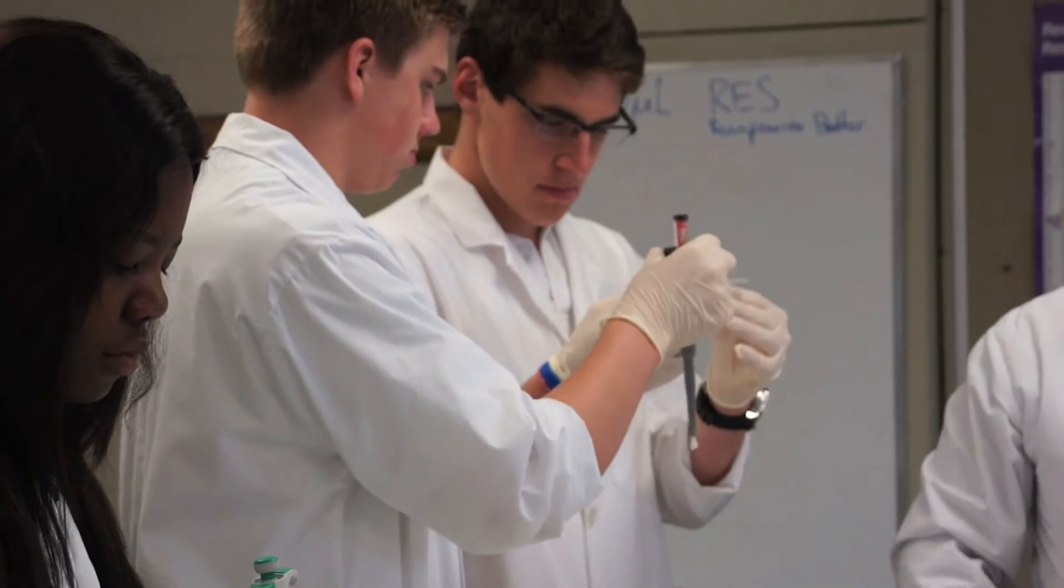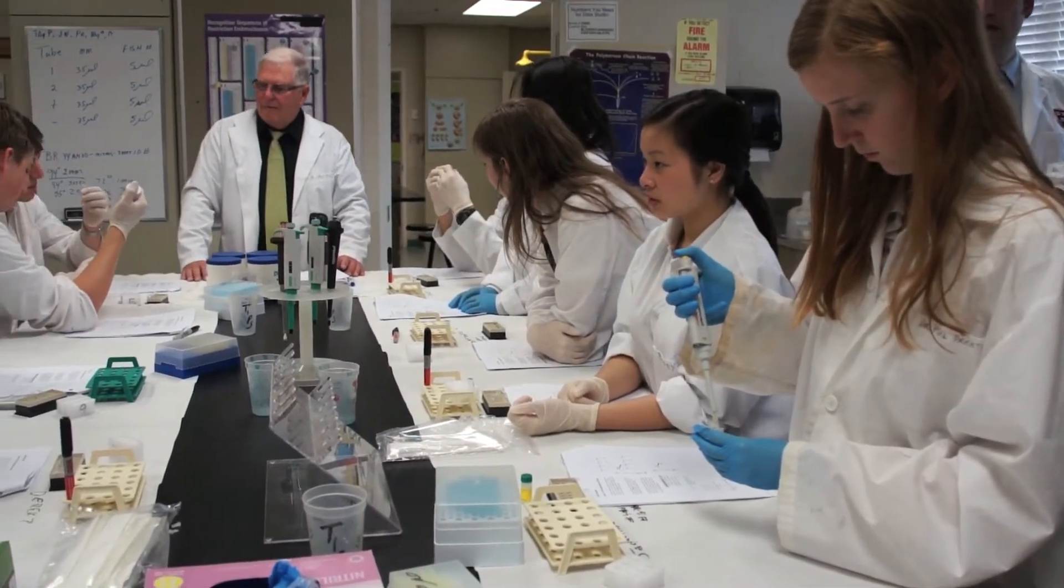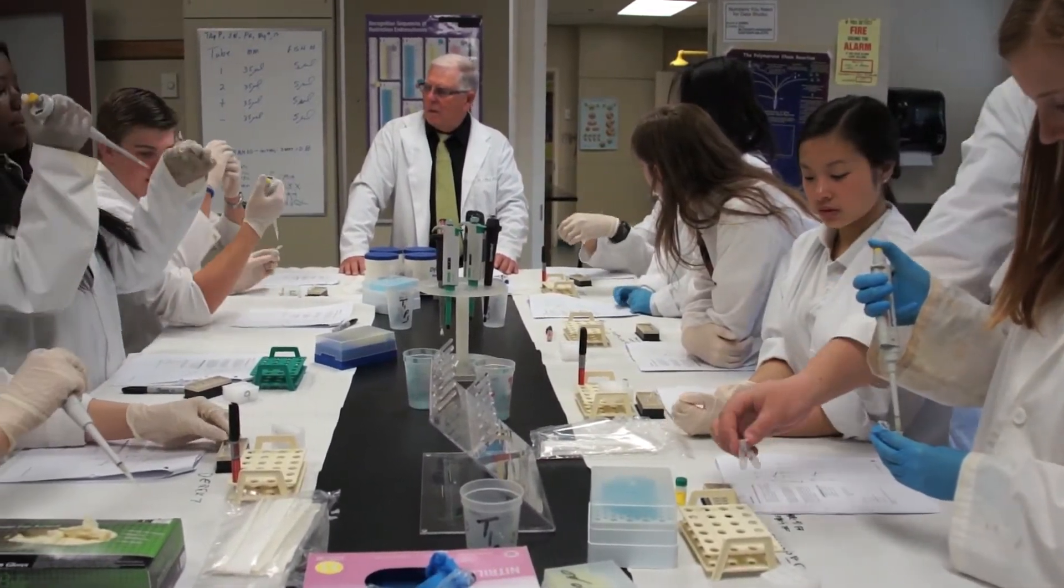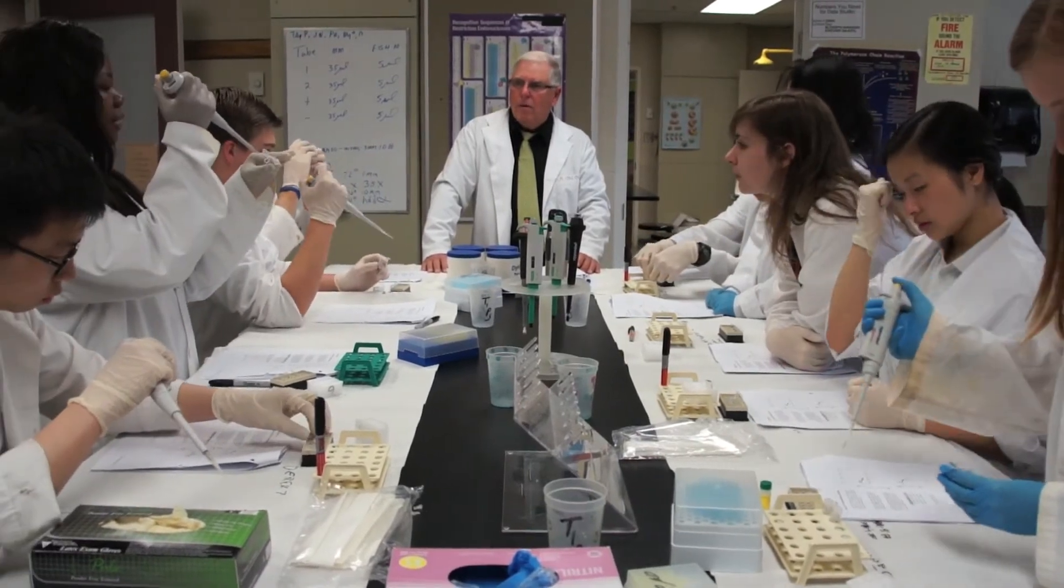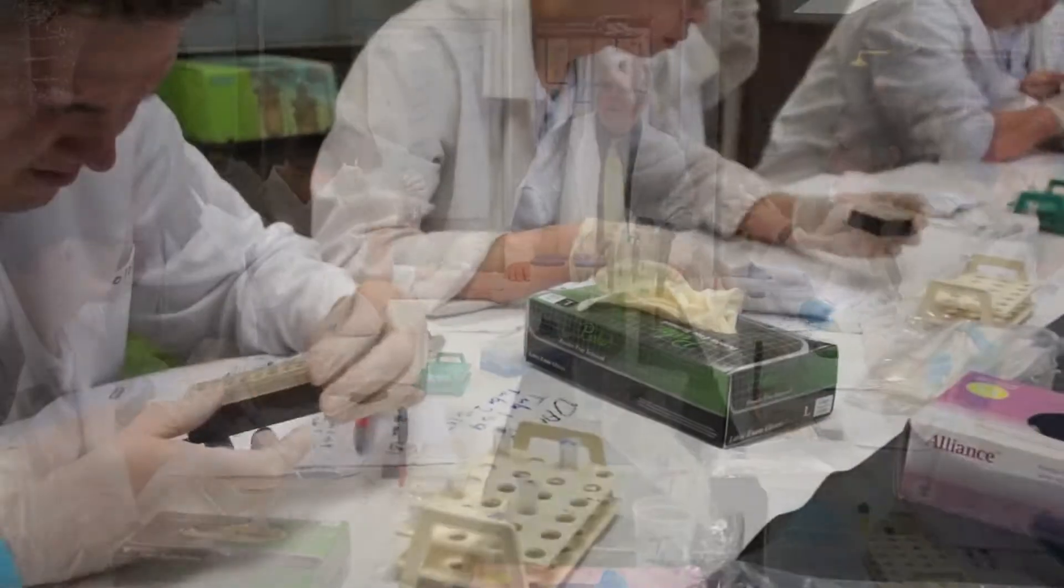So what we did is we took the first samples that Mr. Bone supplied us and what we were trying to do is isolate one specific gene that was maintained within the mitochondria of the cell.